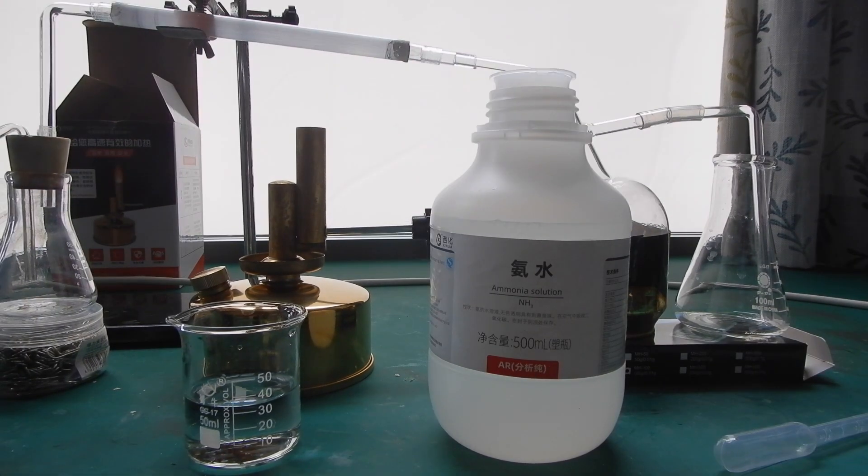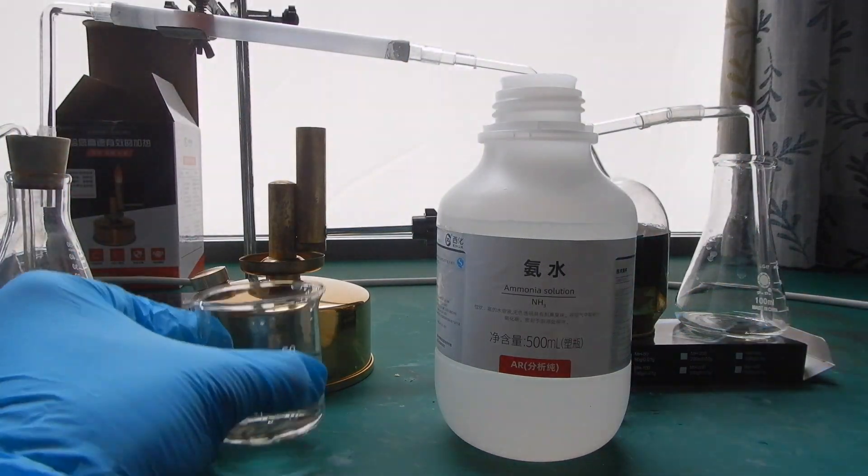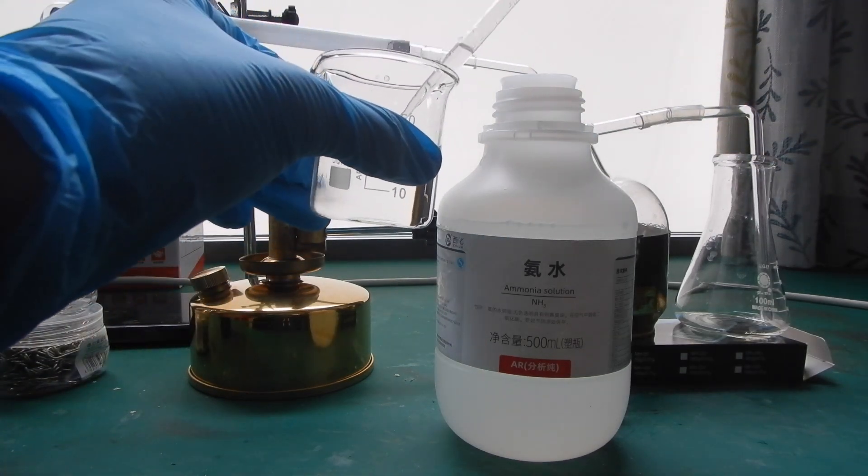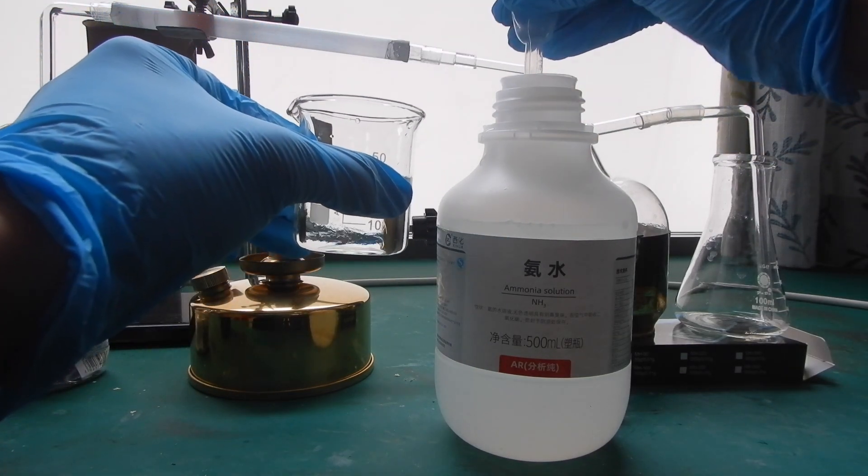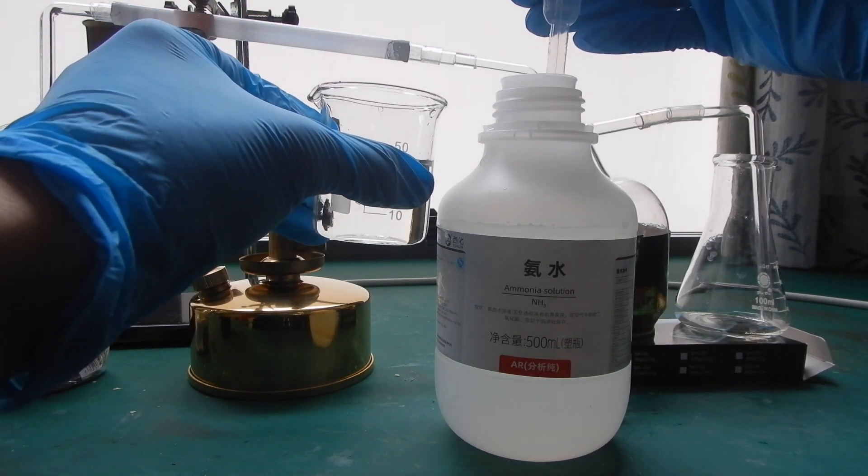Measure out 17 milliliters of concentrated ammonia, which has a mass percentage of around 25% ammonia. Then mix this with an additional 34 milliliters of water to make roughly 50 milliliters of dilute ammonia. Pour this into the conical flask.